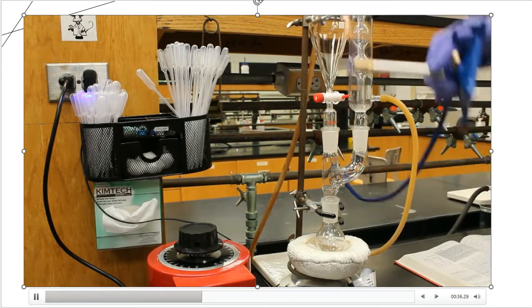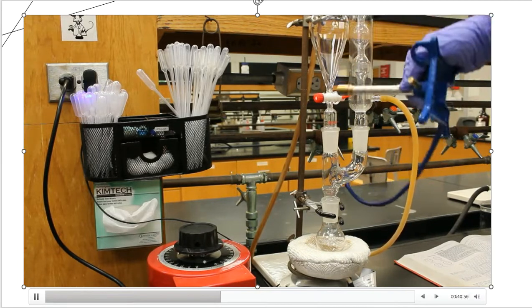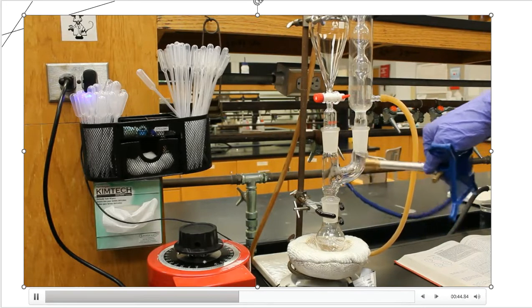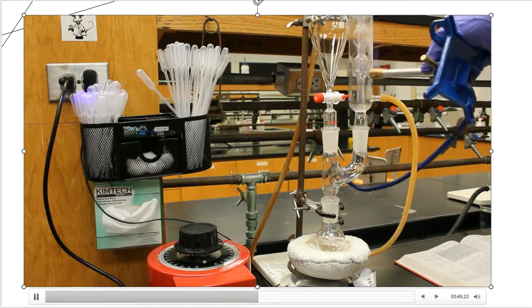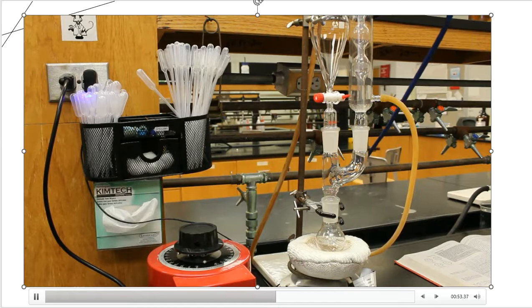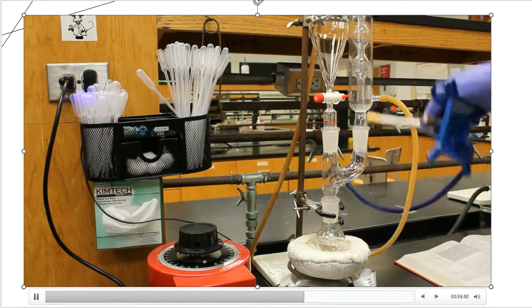So I'm going to open up that cap. If there's water vapor up here in the separatory funnel, that can leave as well. But I just need to get rid of all the water. We've seen water problems, especially with things like Grignard and stuff as well. So this is just going to help ensure that none of those byproducts or side reactions are going to destroy the actual product that we're going to be forming in this reaction.